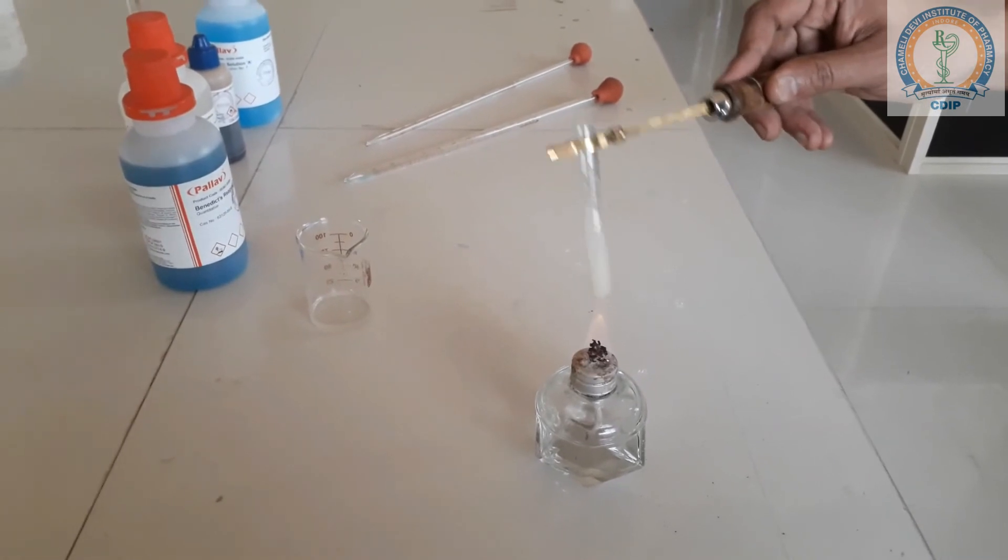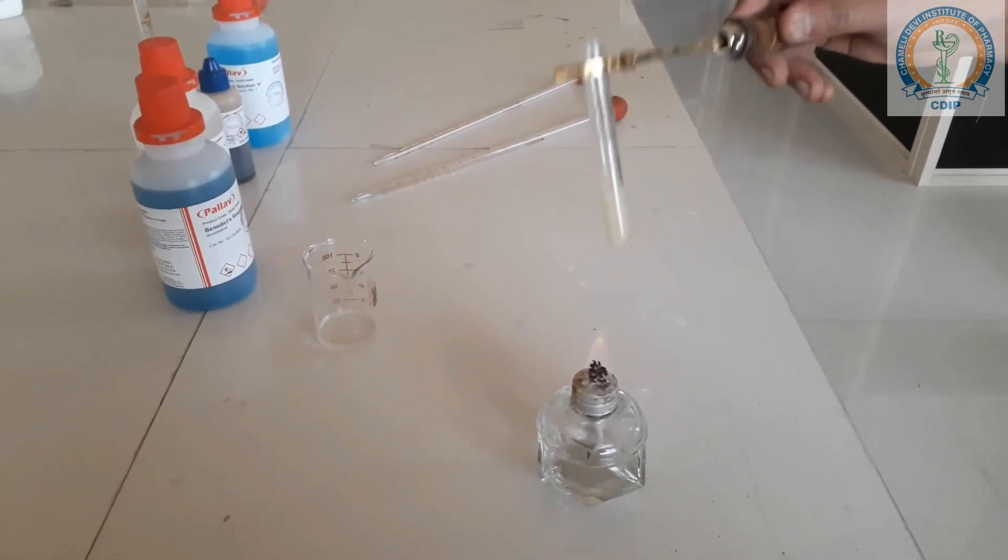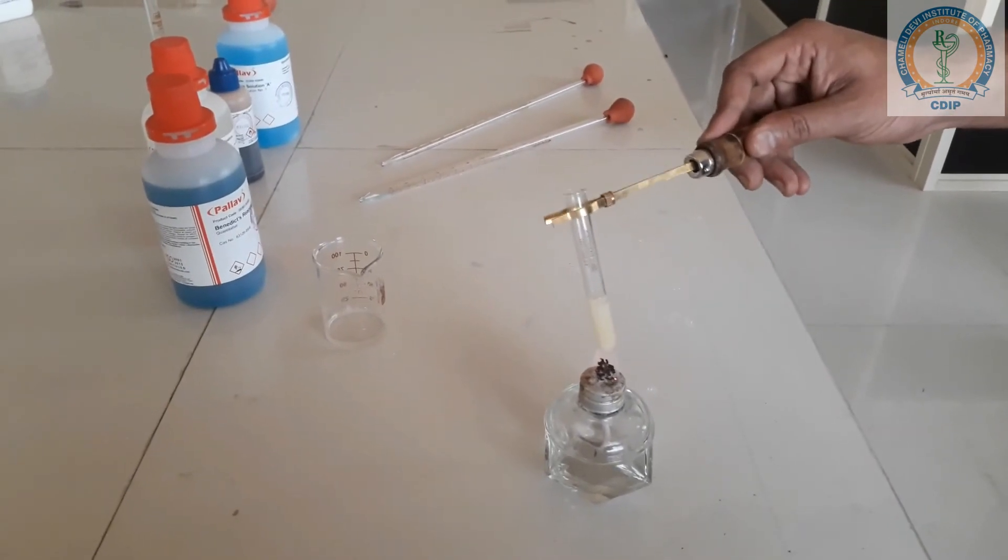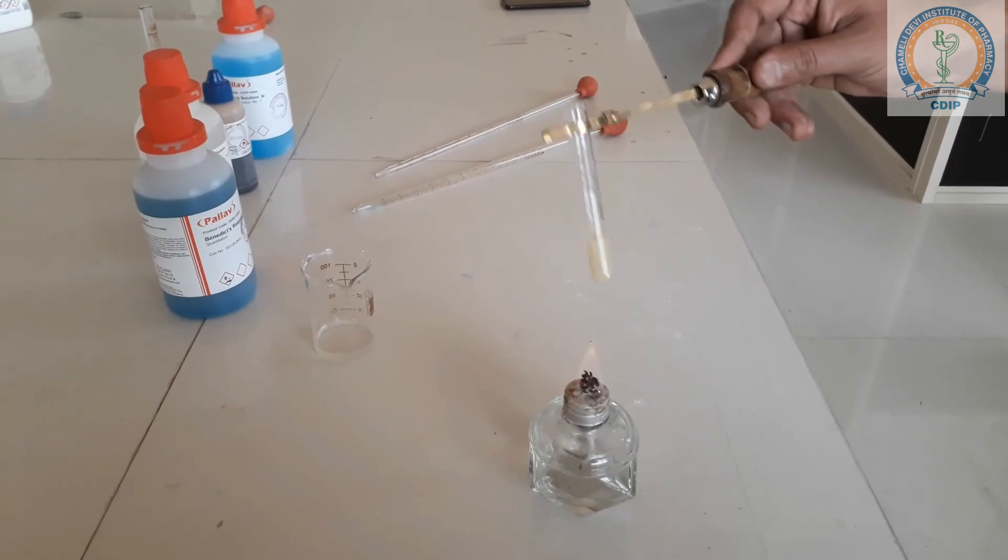On boiling, you can see here the formation of reddish precipitate. It shows the presence of carbohydrate.